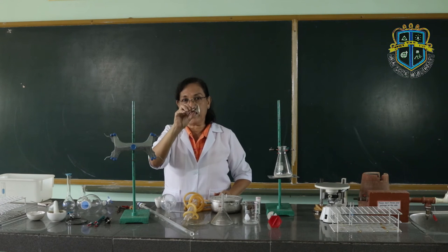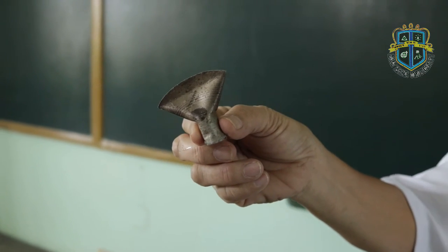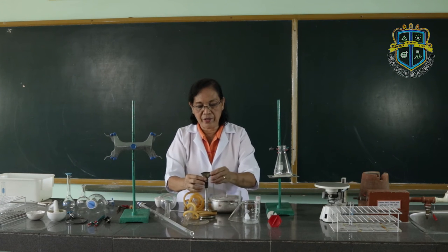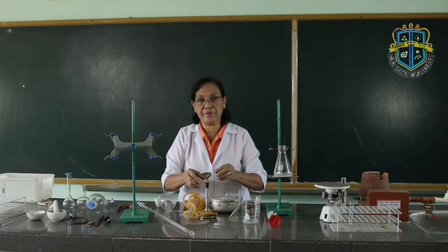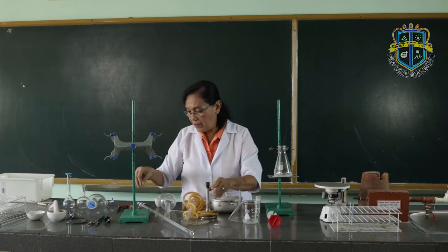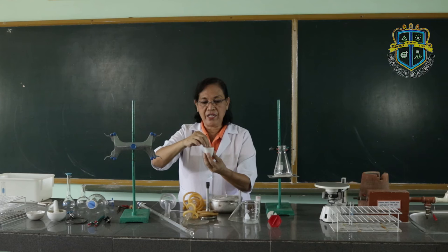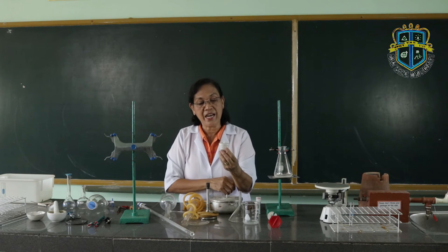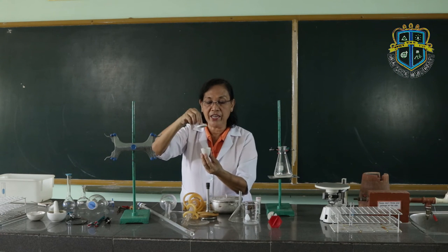This is the fishtail. The fishtail is used together with the Bunsen burner to spread the flame — you place it on top of the barrel of the Bunsen burner. This is the crucible with cover. For chemical reactions where you heat the substance inside the crucible and air is not needed, you cover the crucible.